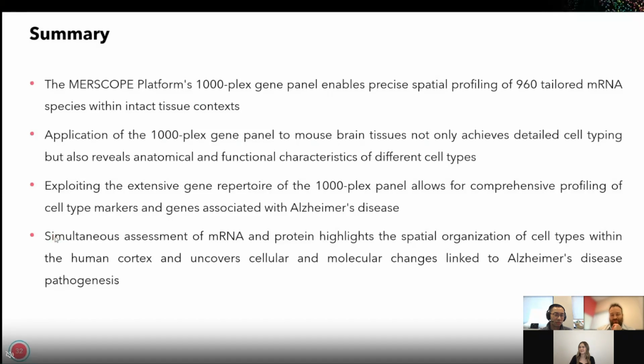Great, thank you. Next question here. This is a two-part question. It asks, does cell segmentation account for diverse cell shapes, for example, axons of neurons that may be distal from the cell soma? And how does segmentation ensure the transcripts far from the cell soma get segmented with its original cell and not necessarily the nearest cell soma?